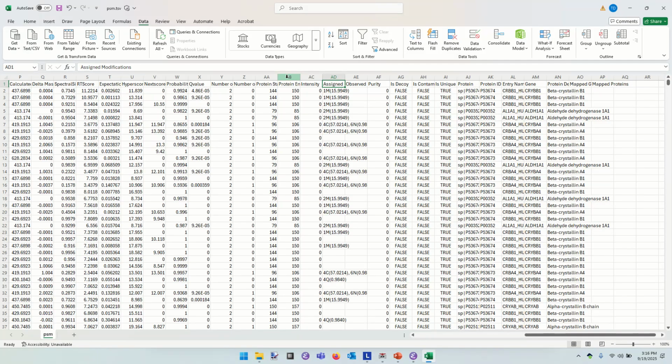And simply working with the spectrum to show how the score drops as you move it from position to position is one way to go about that. In this case, the PTMs we had were all pretty tightly associated with a small group of amino acids, except for single oxidation. We allowed 4 different amino acids on which oxidation could occur. And we're not really getting information here on how sure we are that it's this amino acid and not that other one.